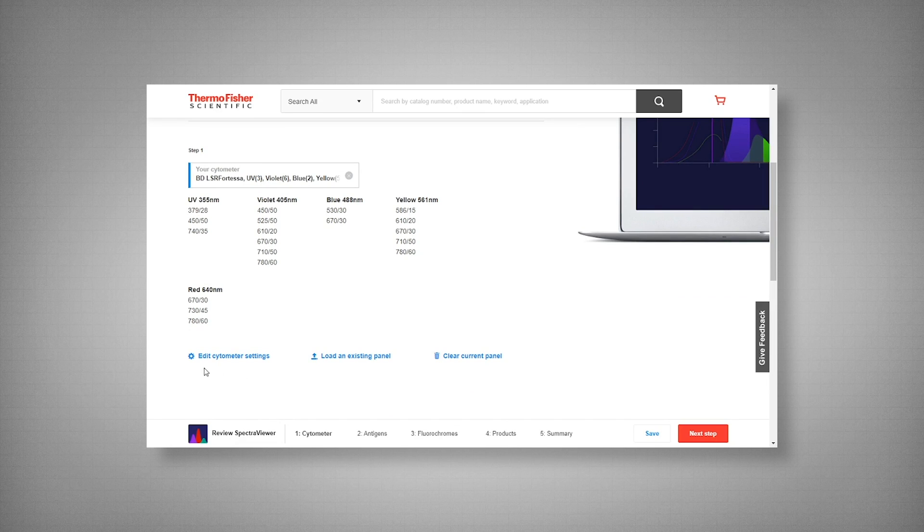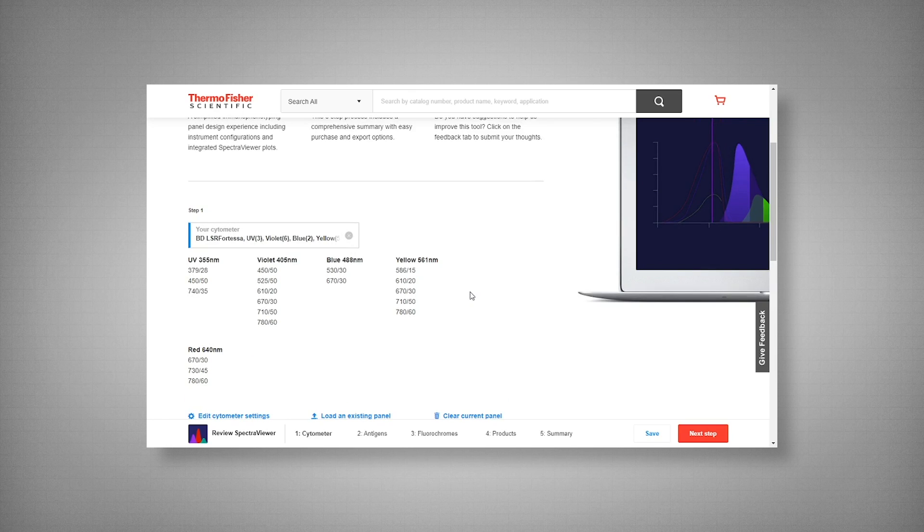You can also edit your settings such as the bandpass filters and wavelength, or simply build your cytometer from scratch using your own parameter configurations. Now I will be using the BD LSR Fortessa.